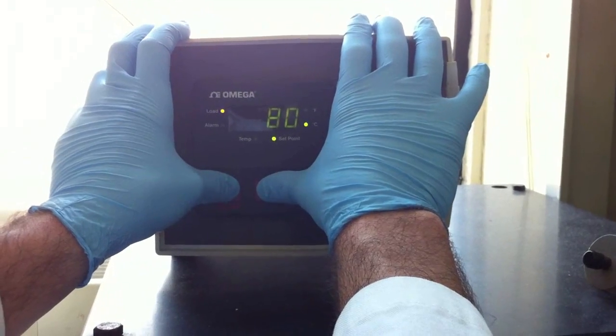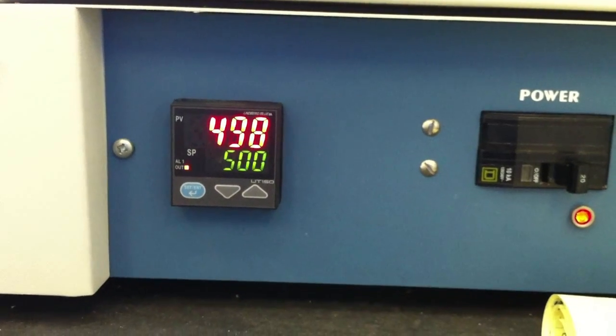The electrode is again heated to 80 degrees Celsius, followed by a treatment at 500 degrees Celsius.